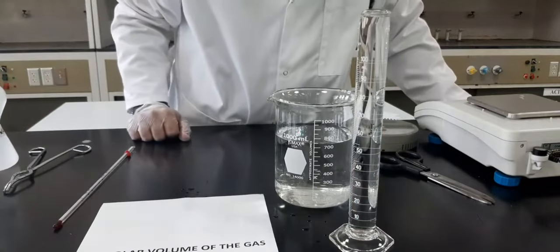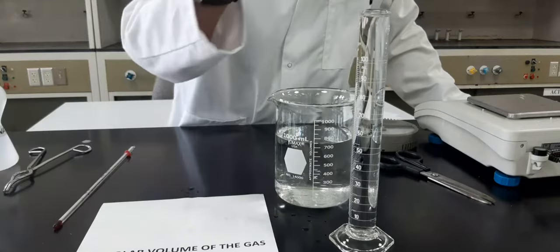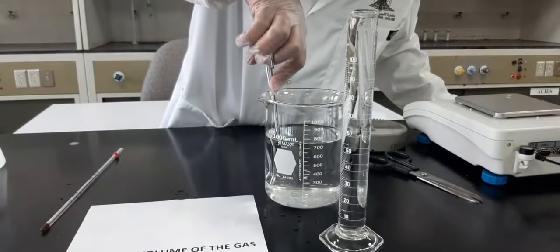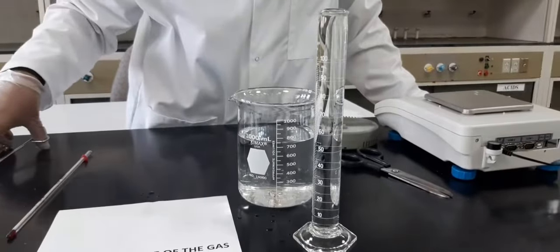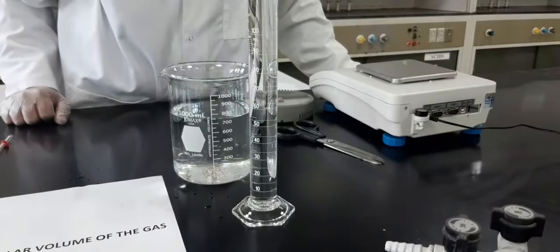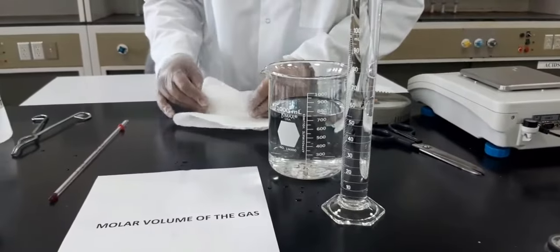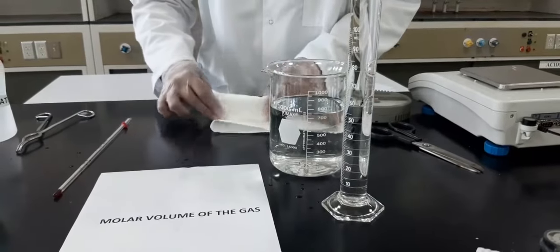Now we'll take a small piece of tissue, fold it 3 to 4 times, and then we're going to place this cylinder over the magnesium which is inside the beaker to let hydrochloric acid react with the piece of magnesium, which will form hydrogen gas and magnesium chloride. Magnesium chloride will stay in the water, whereas hydrogen gas will be captured by the cylinder.